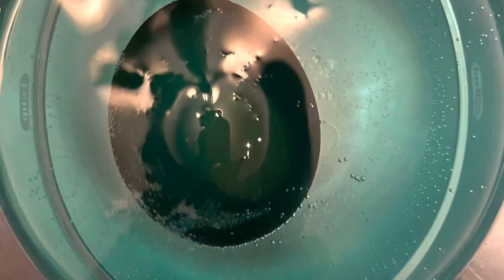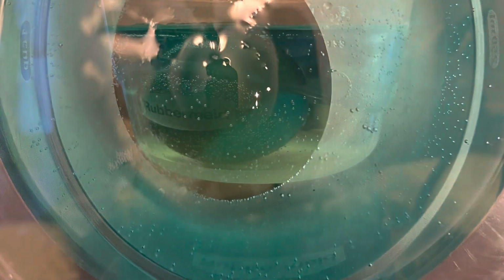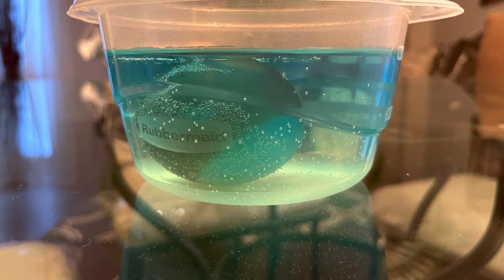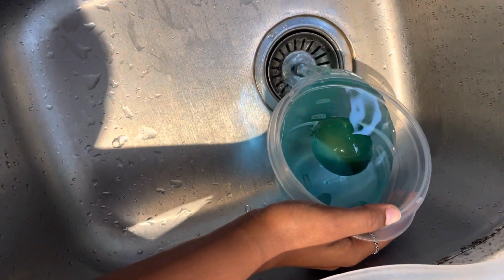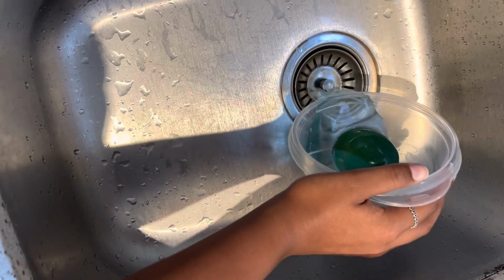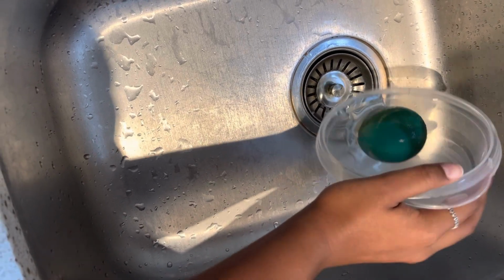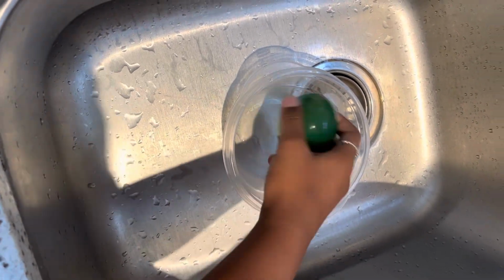This meant that Egna was sitting in a solution that contained more solvent than the cell. In this solution, the net H2O moves into the cell, going from a high concentration to a low concentration. This made Egna's shape larger because there was an increase in volume, which also increased the turgor pressure of the cell, because there was more water to keep the shell's shape. Again, if I left Egna in this solution for much longer, she might have gone through cytolysis, which is animal cell death due to such a high turgor pressure that the cell explodes.